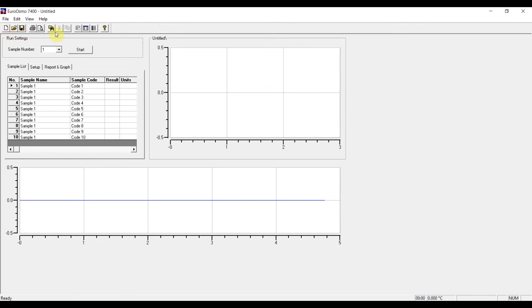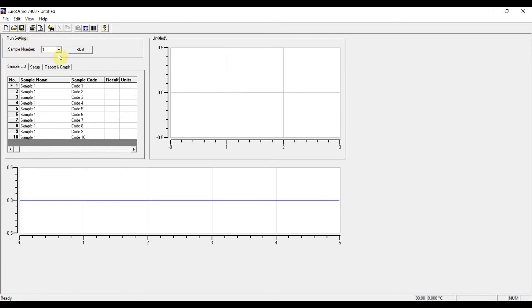Here we have some quick buttons. And below that we have the run settings. And this is where you start the measurements and determine which sample number from the sample list is going to be recorded.